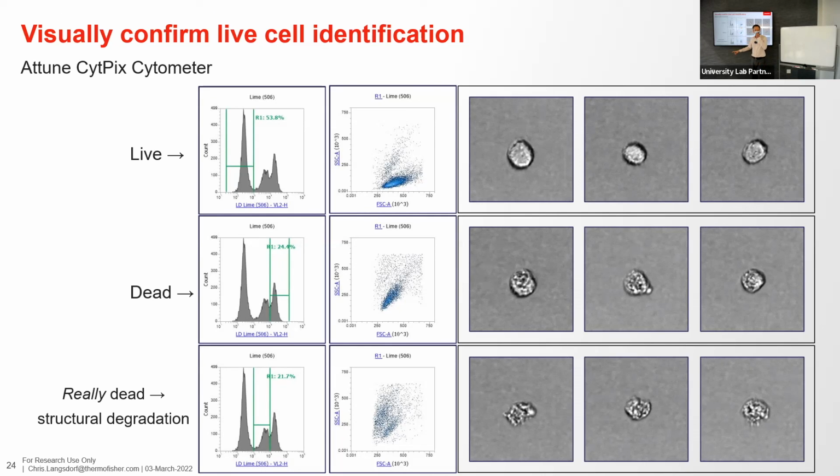And also multiplexing with antibodies. If you have lymphocytes and monocytes, that's often why you see multiple peaks also, because monocytes are much larger than lymphocytes. They will be brighter on this. So in whole blood, I often see 4 peaks, and it's totally normal. It just depends on what you're studying, right?